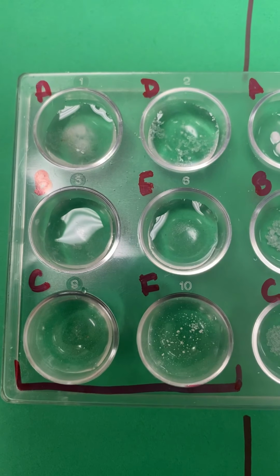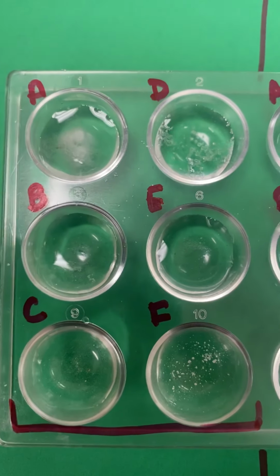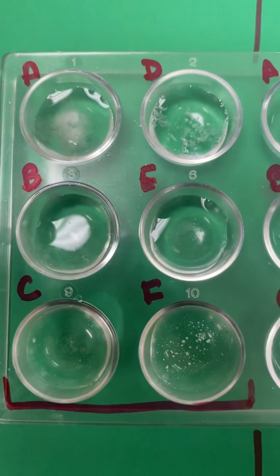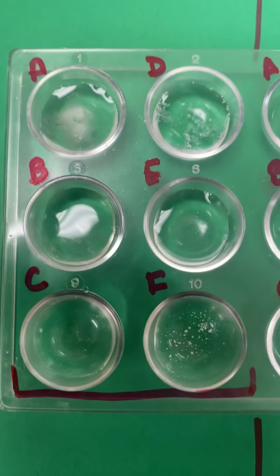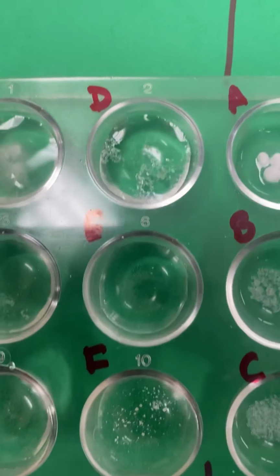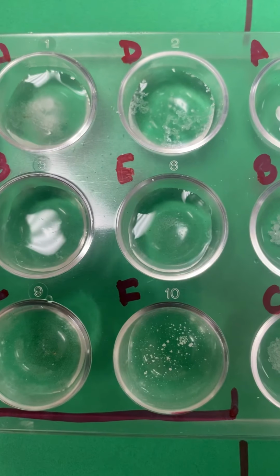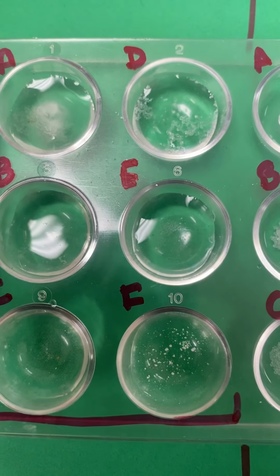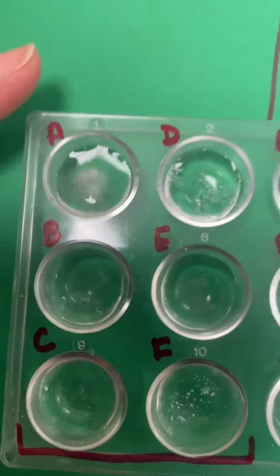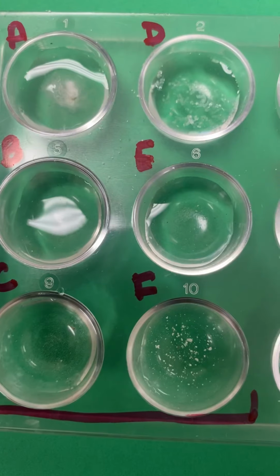So I would say A is dissolved. B looks like it, through the camera, it dissolved. It's kind of got a glare on it, but C dissolved. D looks like it's floating on top. Yep. So that one did not dissolve. E looks like that dissolved. Or is it? It's hard to tell with this on the phone. Yeah, I think it's... And then F looks like it did not dissolve.